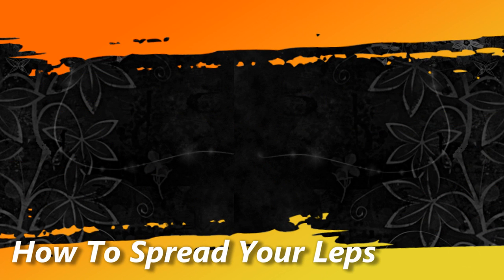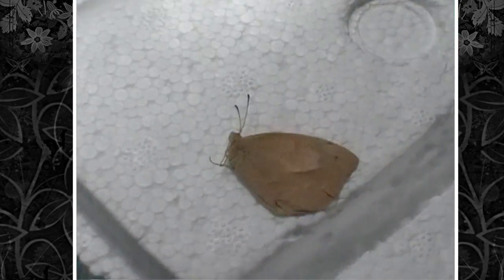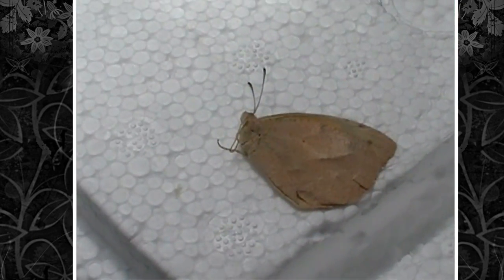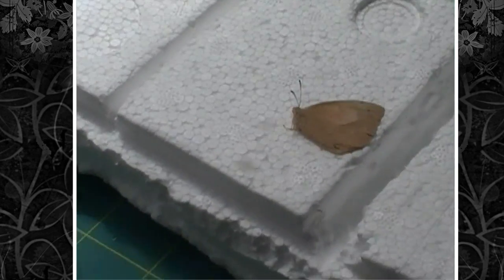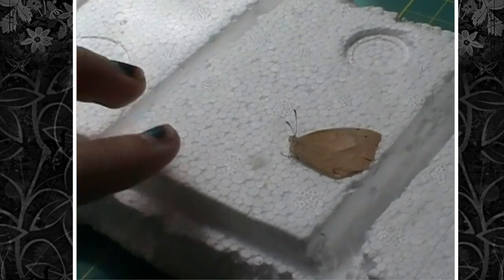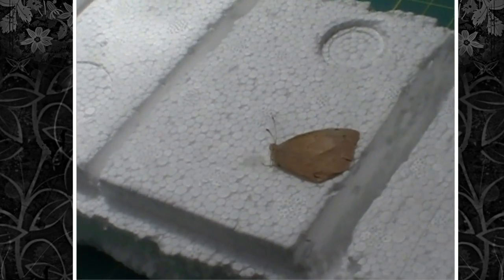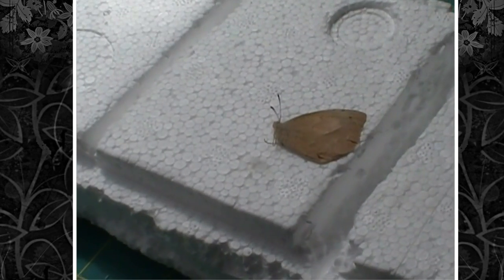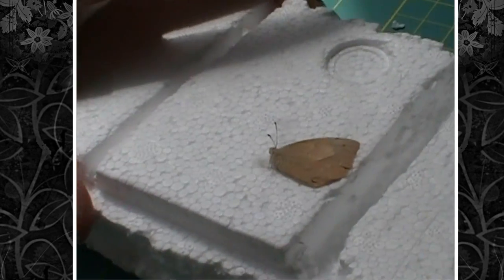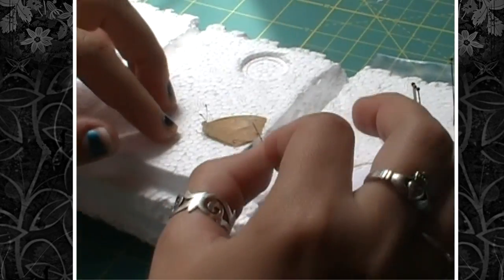Hey guys, so I'm going to teach you how to spread your butterflies and moths today. You're going to want to take your butterfly out of the freezer, and a couple things that you're going to need include a spreading board. You can buy expensive ones from Bioquip, but I just used this piece of styrofoam and put two different slits in it — a smaller one and a bigger one for spreading different sized organisms. You're also going to want little slips of paper and insect pins.